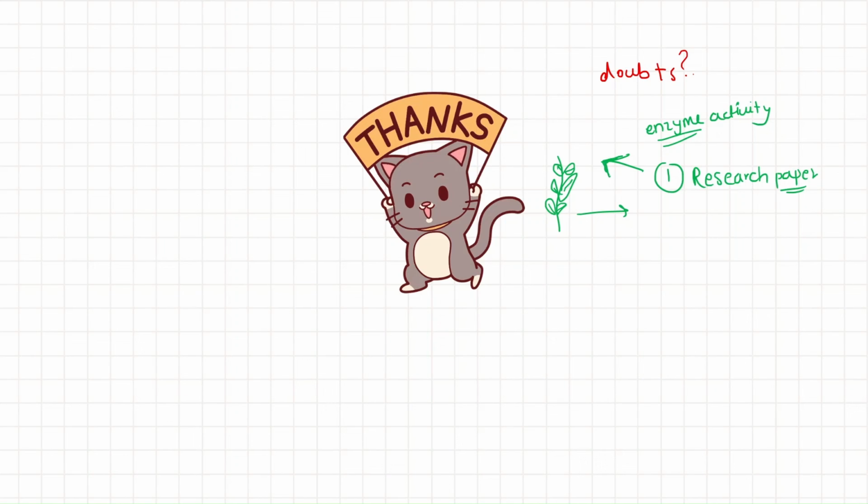The pH of the solution or the compounds present in the experiments matter, so you will have to keep it under consideration. Also, while collecting samples, it is very important to maintain the temperature properly at 4 degrees Celsius while carrying out these kinds of experiments.